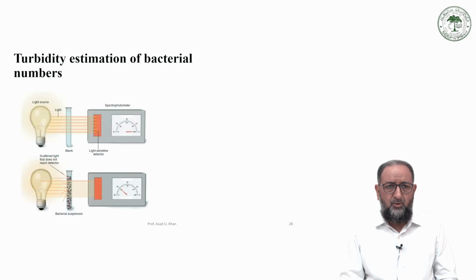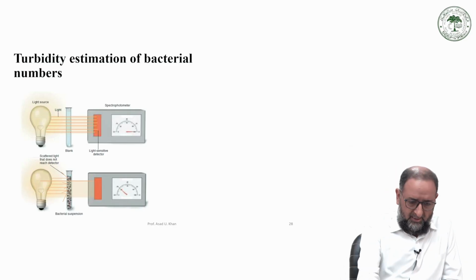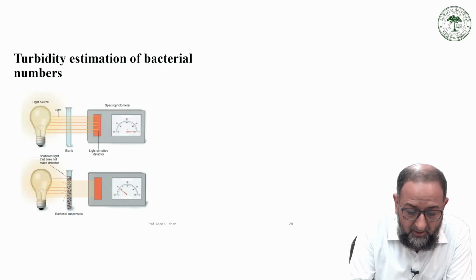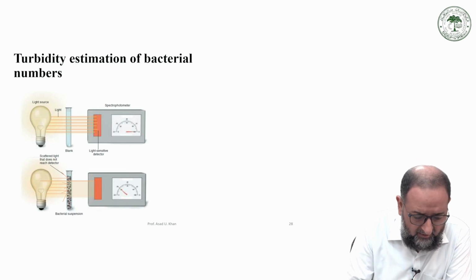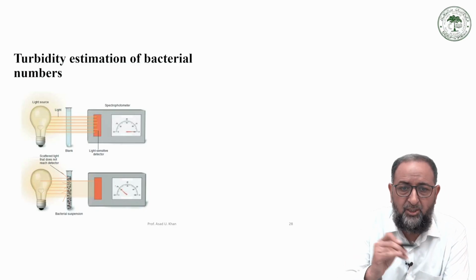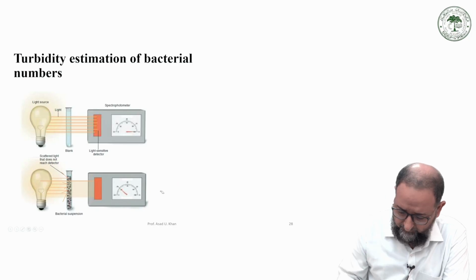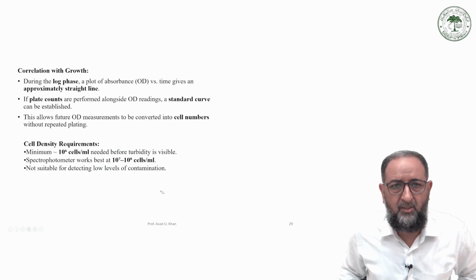This is the simple source of light, and this is the tube present here, the blank tube. Here the cells are present. So if you compare with the blank tube, the deflection is at the 0 level. You can set the 0, and then when you put in the cells, there is a cloud density, and the light passing through this density deflects, so the deflection will change. Now this change in deflection will be calculated as OD, right? And this OD will be referred to further.